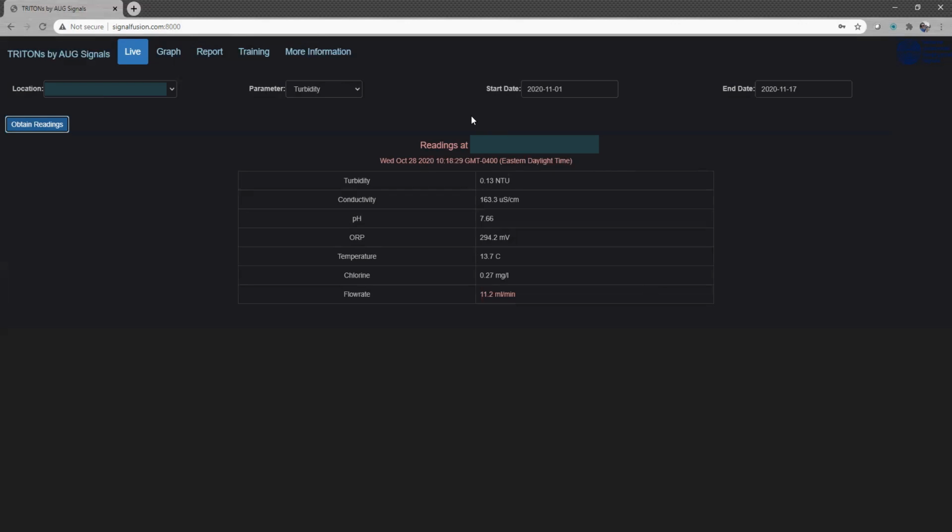When this happens, all the data cannot be transferred here, so the date and time of the last known transmission is shown here, which was roughly a month ago. This will also result in users receiving alerts on their phone, because our water quality monitoring system without an internet connection isn't really very useful.